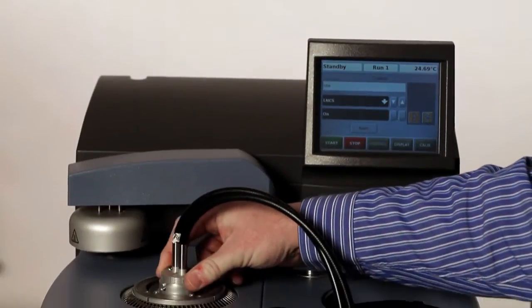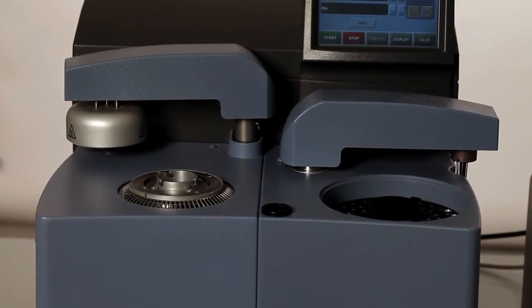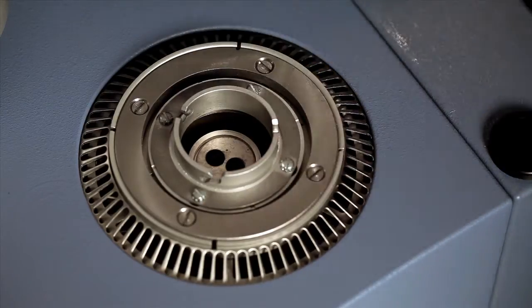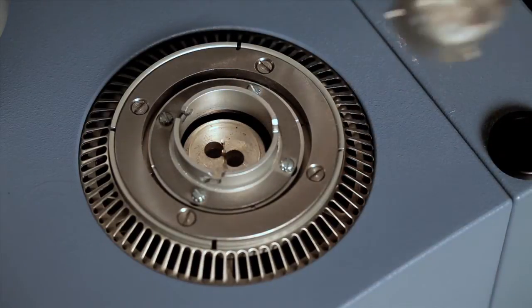As part of the setup, we've inserted the required filters. We can now balance the intensity on the sample and reference platforms. There are vertical positioning screws in the light guide adapter. Make sure that these are set to the lowest point. Using an empty cell, fit the PCA silver lids and quartz window and the light guides into the adapter base.